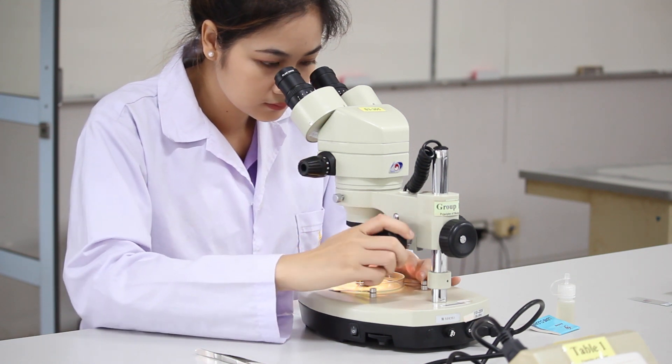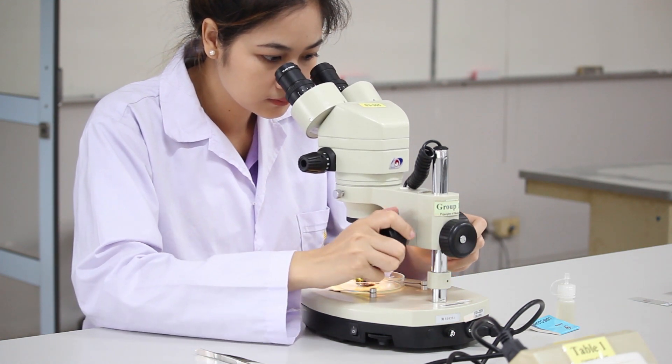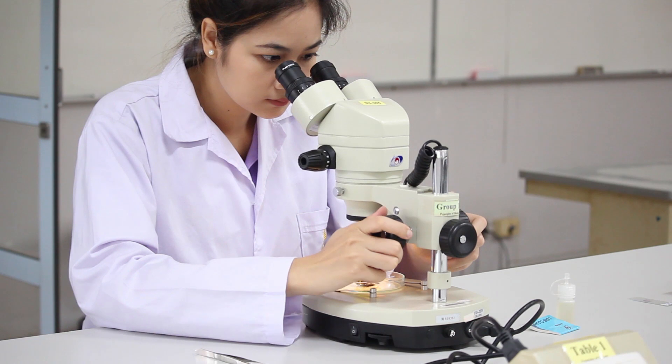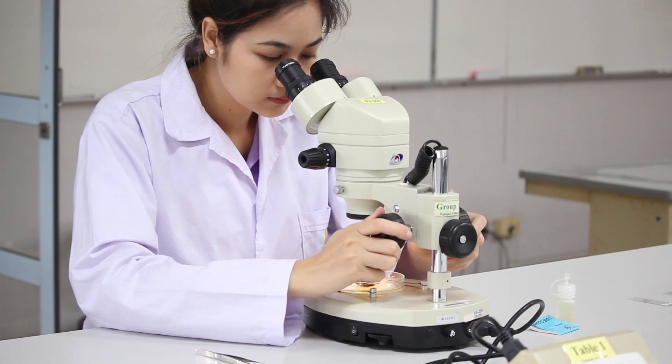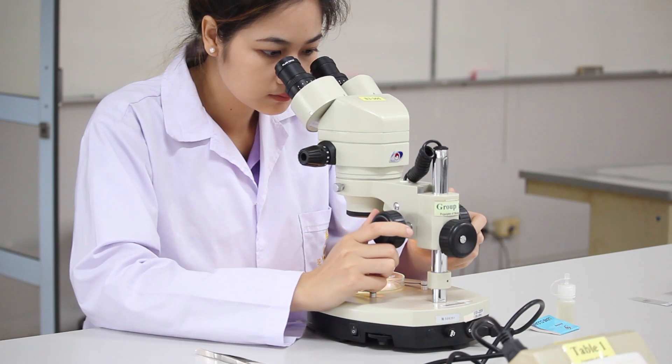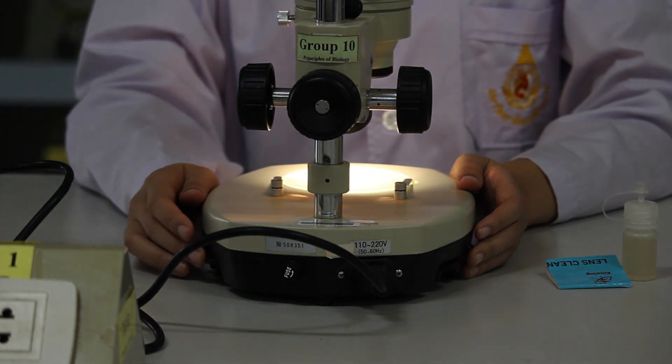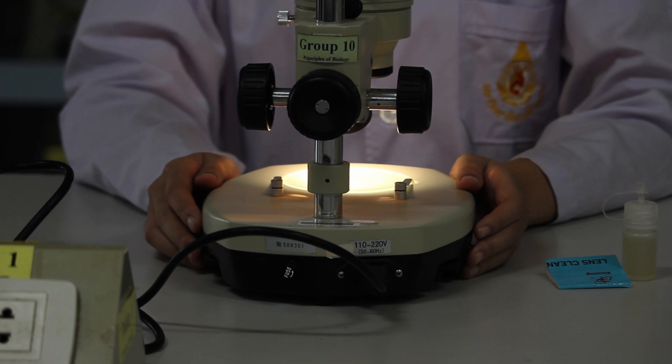After that, adjust the distance between the specimen and the objective lens while looking into the eyepieces until the object comes into focus. The light intensity can be adjusted until the image appears on the eyepiece is appropriately seen.